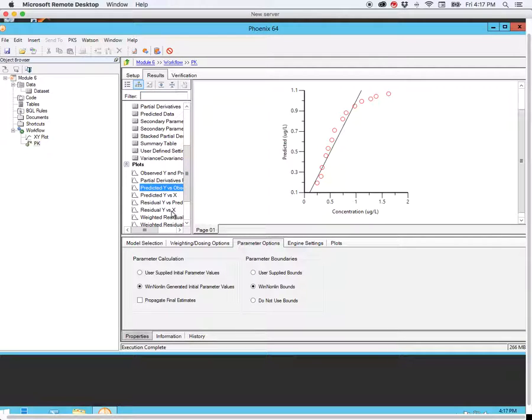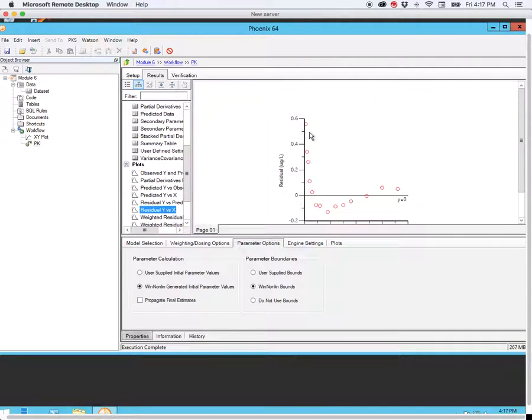We can also look at the residuals, and here again there's this wave pattern, which is not something that we want.